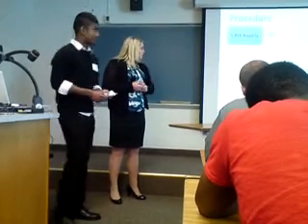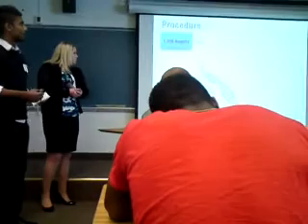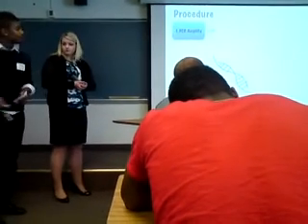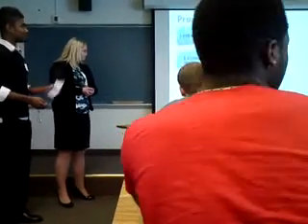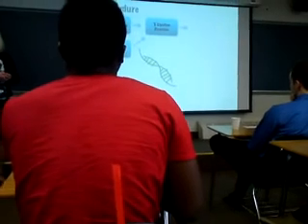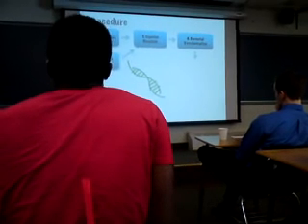So we conducted a series of molecular cloning procedures to further look at the FGD expression. The first is PCR amplification, where we amplified our target sequence of FGD fragments. Second is the plasmid digestion. We cut our desired plasmid using the restriction enzyme. The end products of both are then joined in a ligation reaction using DNA ligase, creating a recombinant DNA plasmid. The recombinant DNA plasmid will be inserted into a bacterial host cell, and then the replication process will take over.